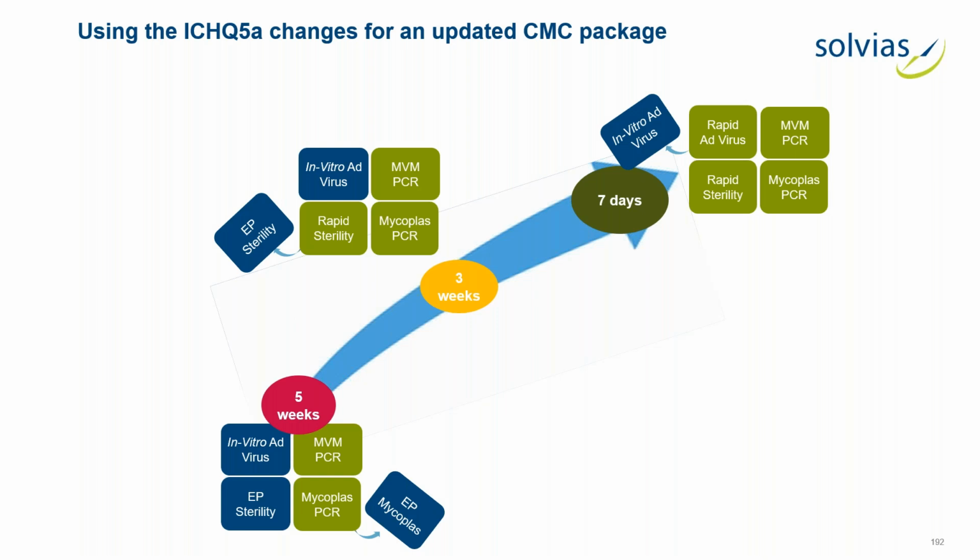Arno's nodding. Aren't we, Arno? Yes. So we are, clear statement, we are developing an in vitro, I know I did the business case for it a couple of days ago. We've got an in vitro adventitious virus NGS assay, which is going to be coming to market in the back end of 2024 and be ready for 2025 in our other sites as well.